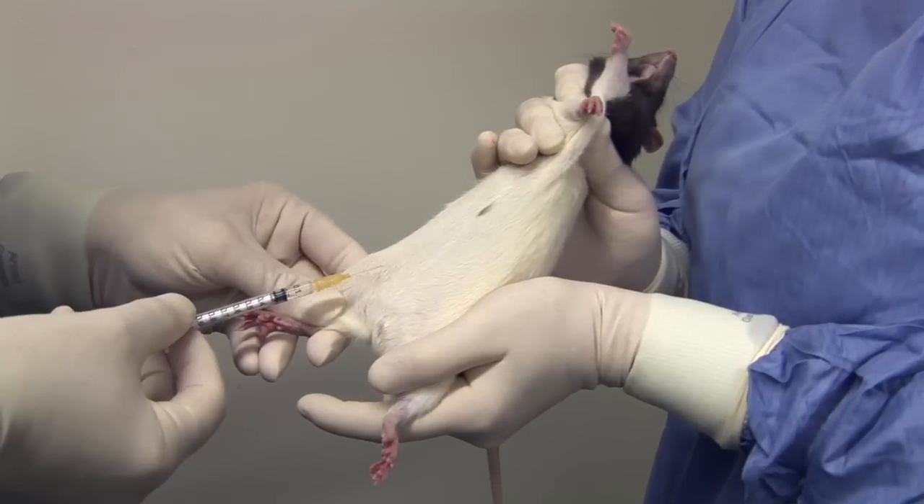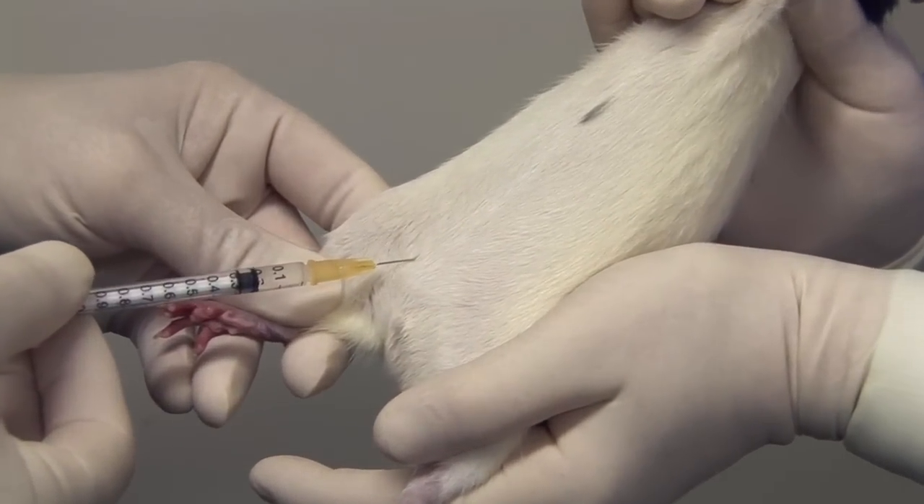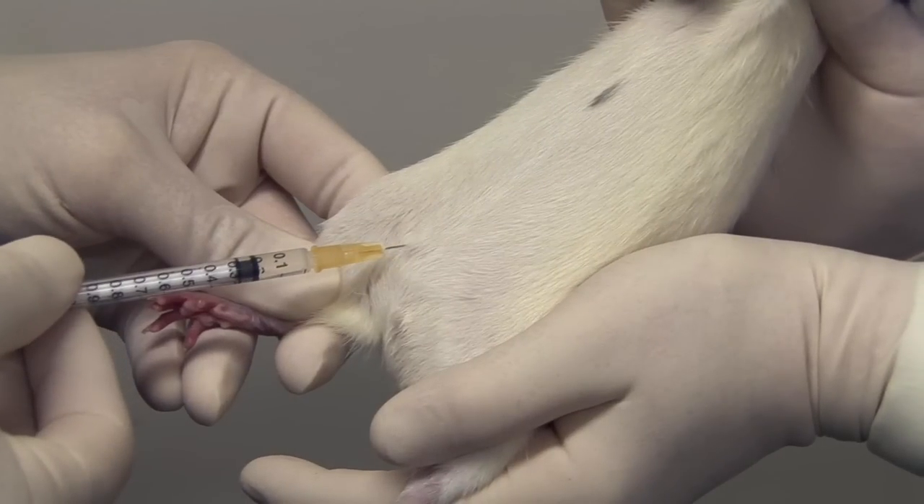Intraperitoneal injection is made into the right lower quadrant of the animal's abdomen so as to avoid the liver anteriorly, the bladder in the lower midline, and the cecum which generally lies in the lower left quadrant of the abdomen or in the midline. The needle should be angled along the line of the leg to penetrate the peritoneum but to minimise the likelihood of penetration of the abdominal organs.